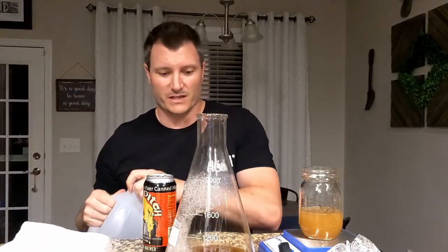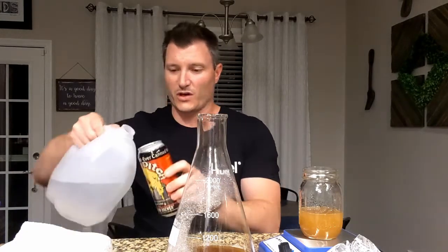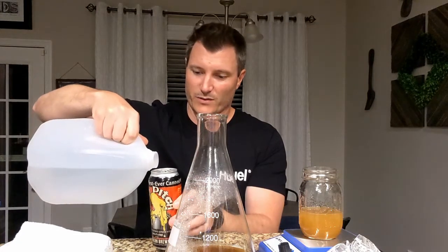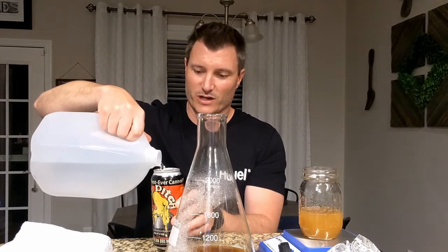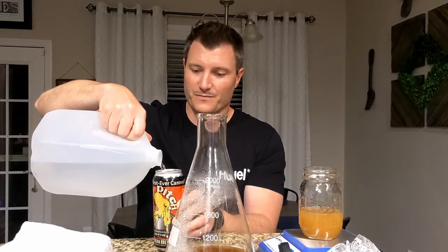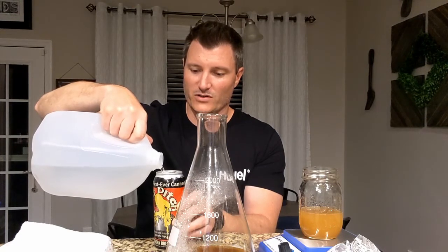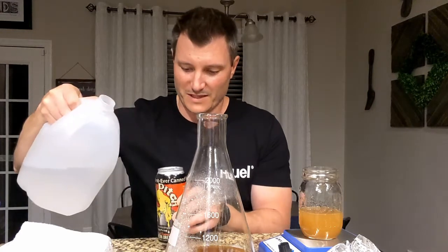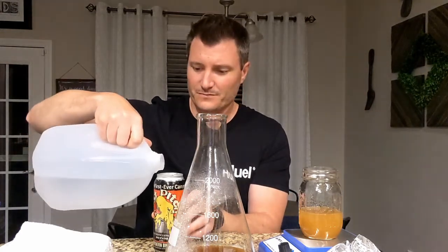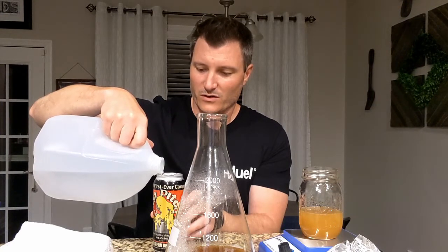Sometimes if I just do a regular starter I'll put a little bit of yeast nutrient in, though it's not required — it just helps it multiply a little bit faster. So we're going to pour this right into the flask. Then we're going to fill it almost all the way up with spring water — we're going to try to do equal amounts of spring water and wort. That also helps get anything left in the can out of there so it mixes evenly.